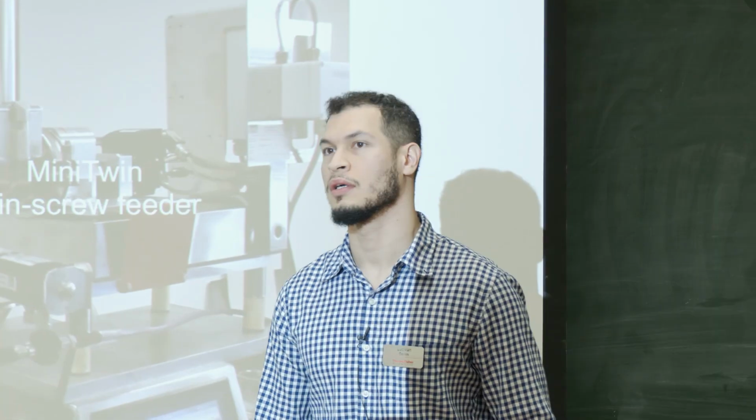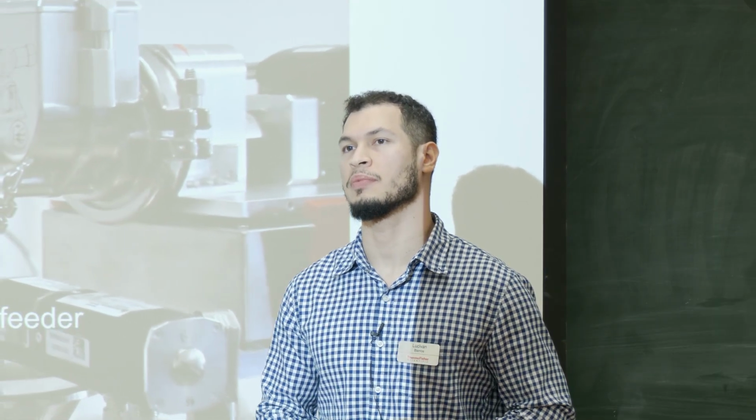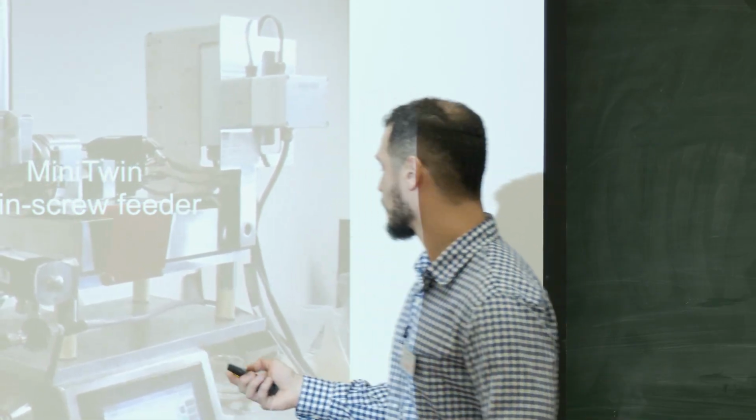Can we use it for emulsion, like very low viscosity? Low viscosity, liquid, similar to liquid. Can we use the force feeders? No, we recommend the peristaltic pump. A side pump. Yeah, is a peristaltic pump available? Yeah, just like the one that you have, but we change the tubing. It can handle higher viscosity than water. It depends on the viscosity, but yes. So emulsion, suspension can be handled. Yeah. Okay.